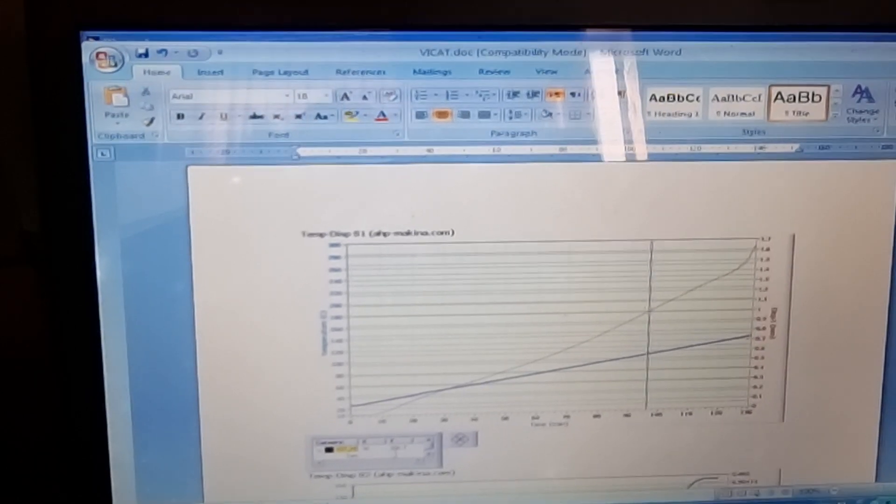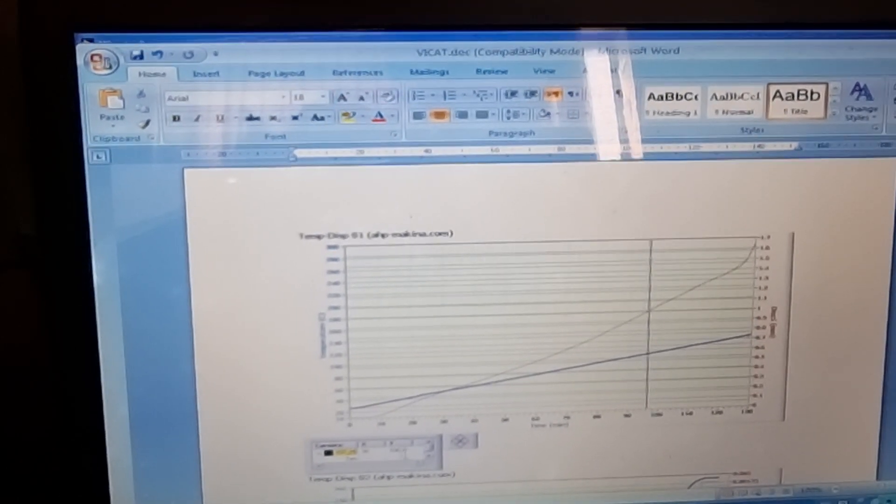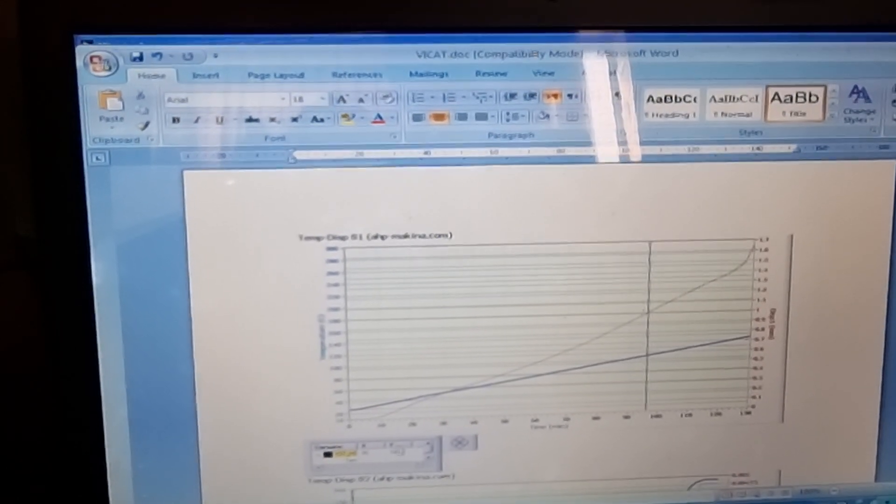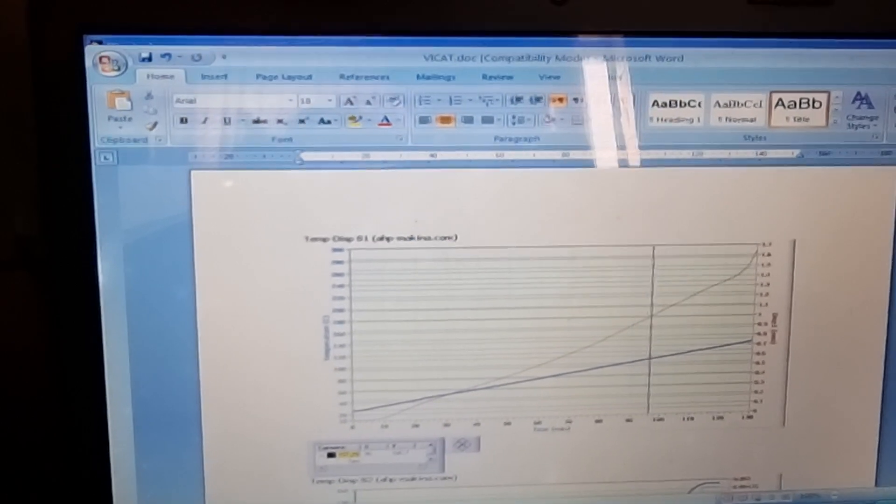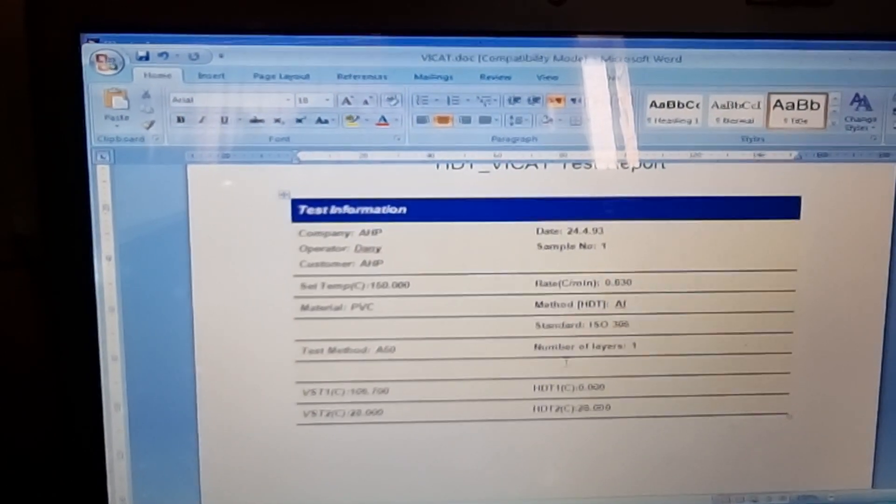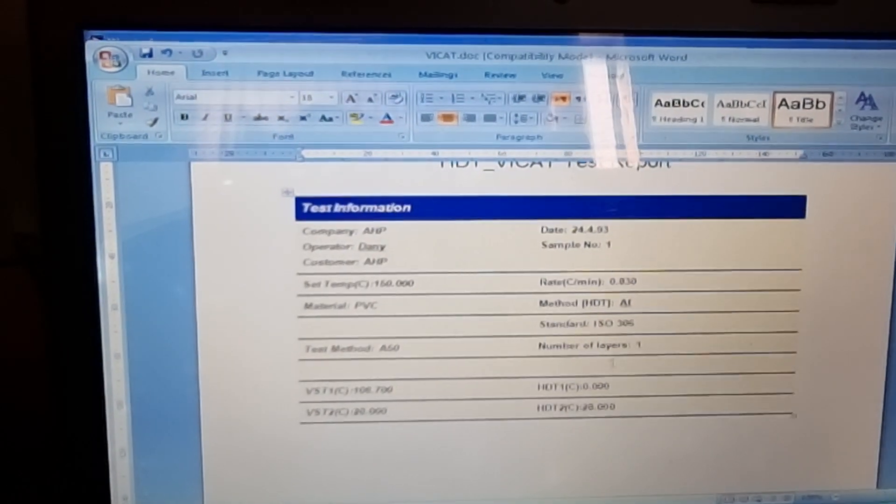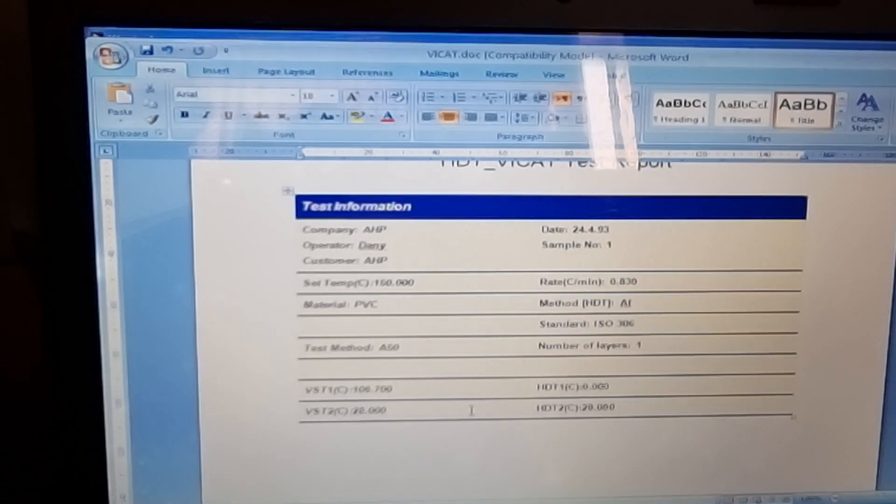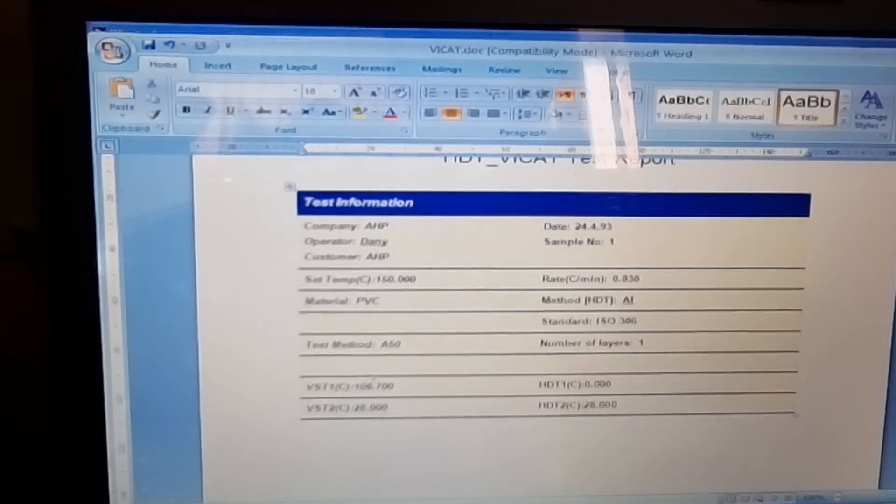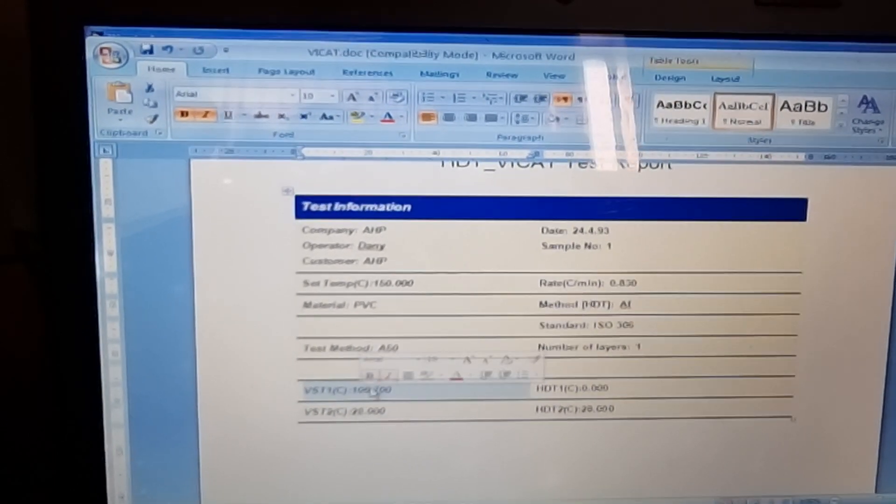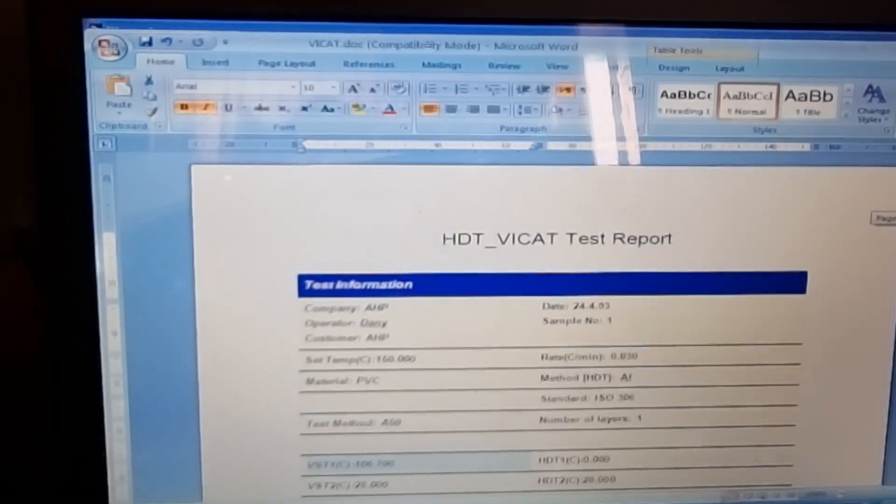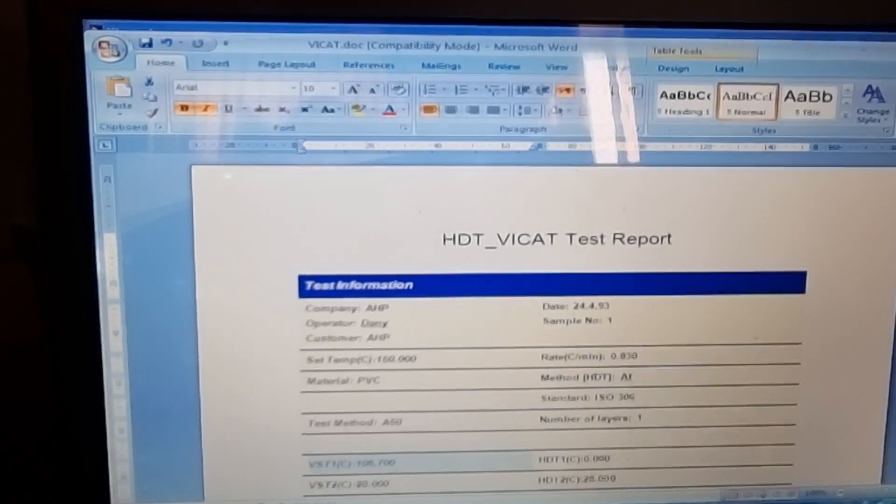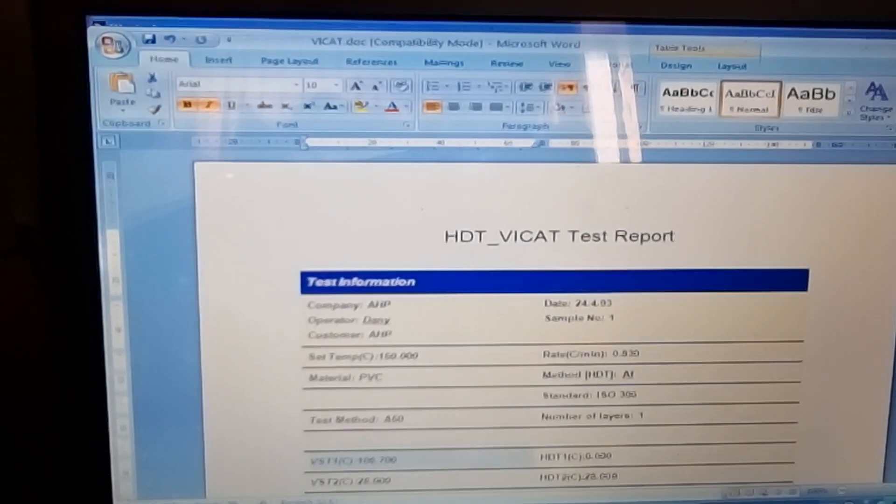You will see the work at the softening point here, and also here you will see the Vicat temperature in the report. That was 106 degrees.